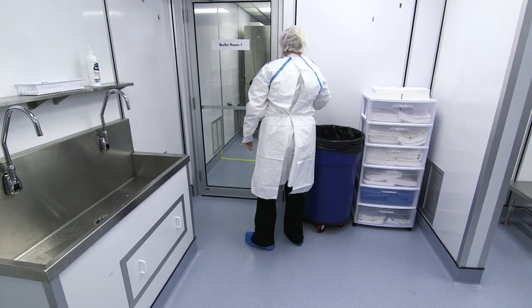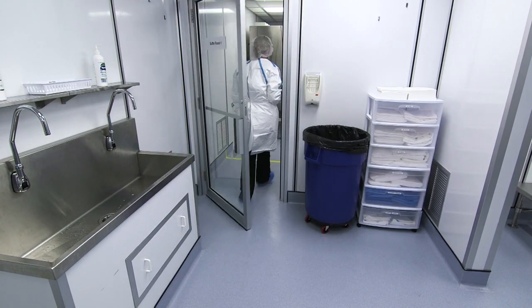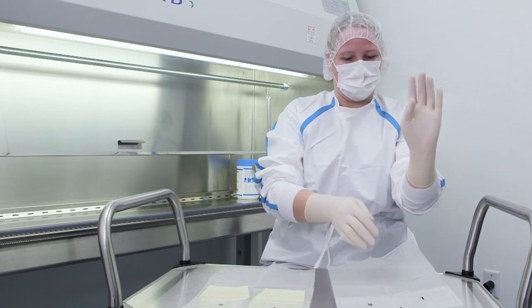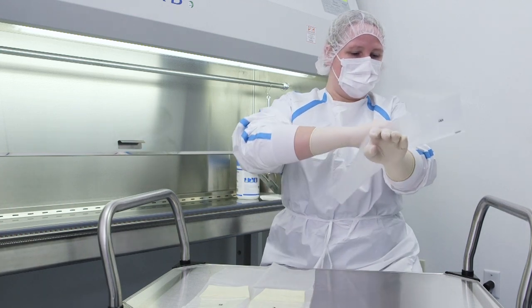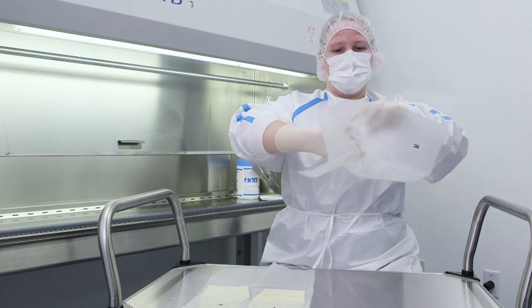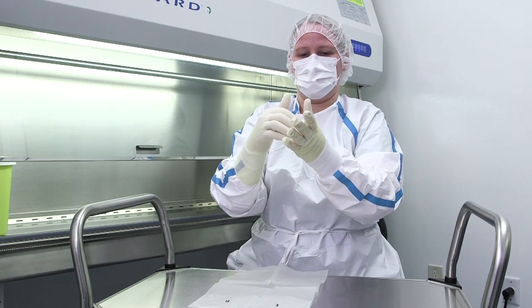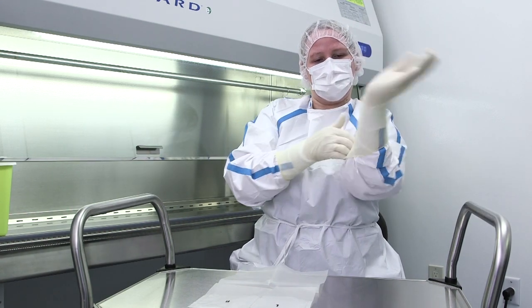Per Chapter USP 797, gloves donned for sterile compounding occur in the buffer room or the containment segregated compounding area. Prior to donning gloves, an alcohol-based surgical hand rub with persistent activity must be applied to all surfaces of the hands. When hands are dry, don two pairs of sterile gloves. The cuff of the first or inner pair of gloves is placed under the chemo gown's cuff. The outer pair of gloves is donned over the chemotherapy gown cuff. Chemotherapy gloves should be changed every 30 minutes unless otherwise recommended by the manufacturer's documentation, and must be changed when worn, torn, punctured, or contaminated.